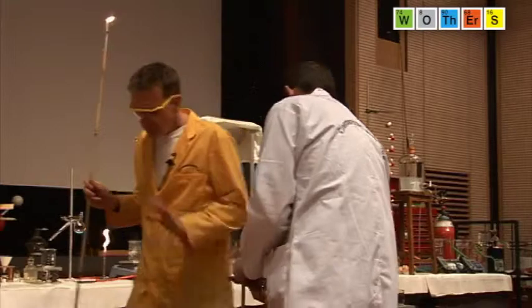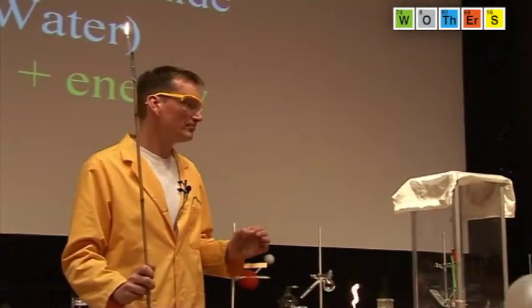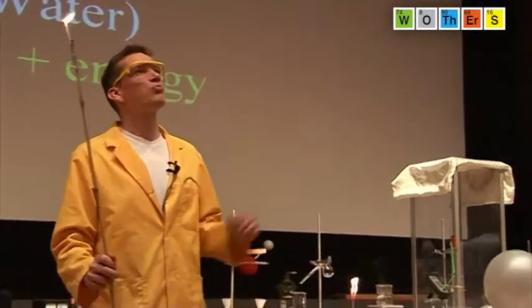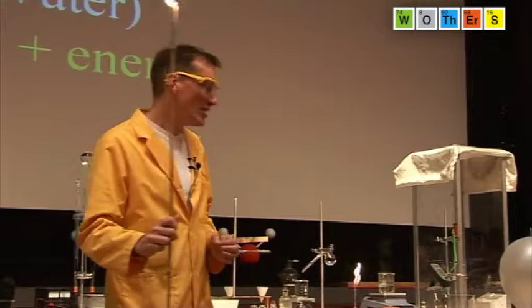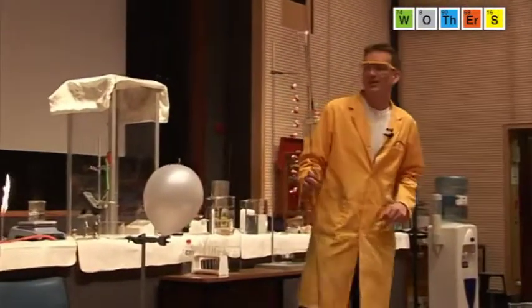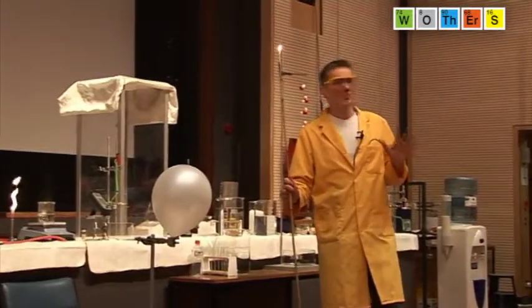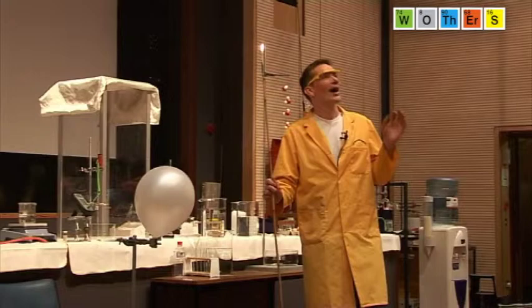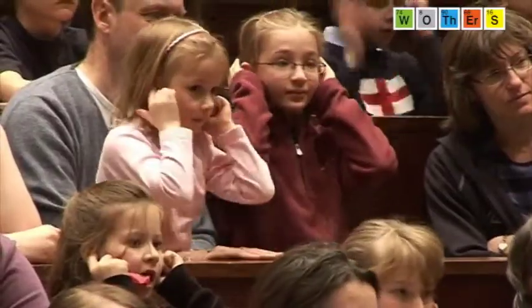Now, we've seen then that hydrogen can recombine with oxygen to form water. The question is, what ratio do we need to mix our hydrogen gas and our oxygen in to get the biggest bang, to get the best reaction? So this balloon here, the white balloon, is filled up with equal measures of hydrogen gas and oxygen gas. Okay? Now, see if this is any louder than the hydrogen itself.